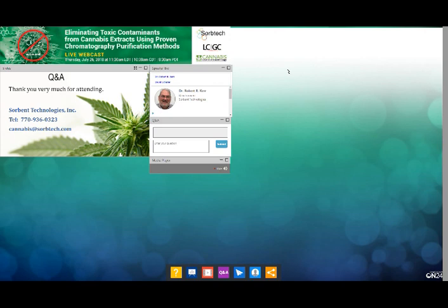So this will be the subject in the future, right? And then I'm going to regenerate that by the method I described. Pretty sure we can regenerate it. We know the manufacturers pretty well. I'm going to talk with them tomorrow, as a matter of fact. So we're going to find out exactly how many times it can be used. But I'm not prepared to make a statement on that yet because I haven't done the experiments yet.